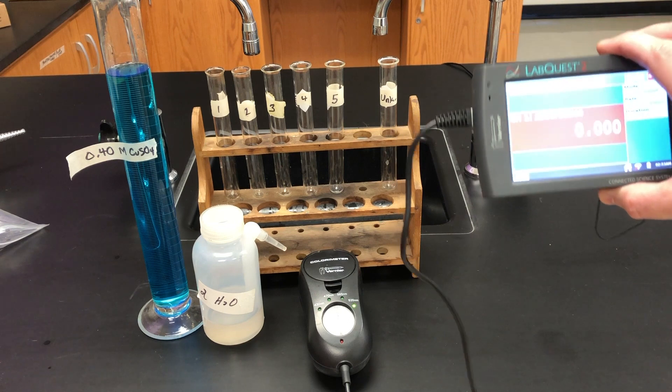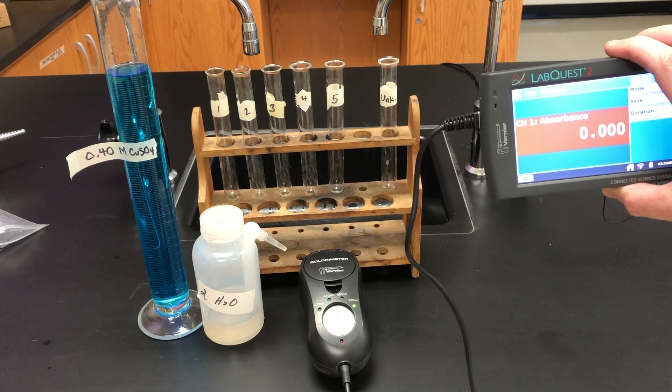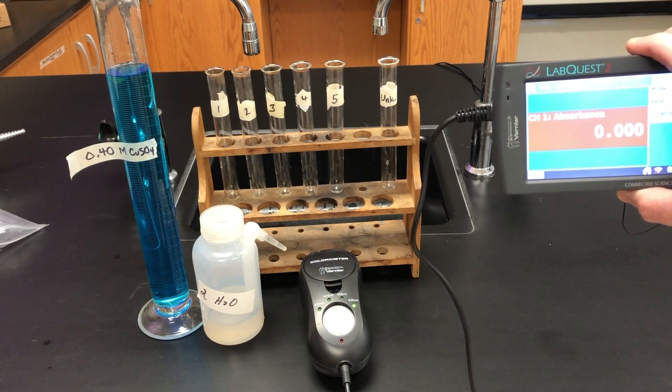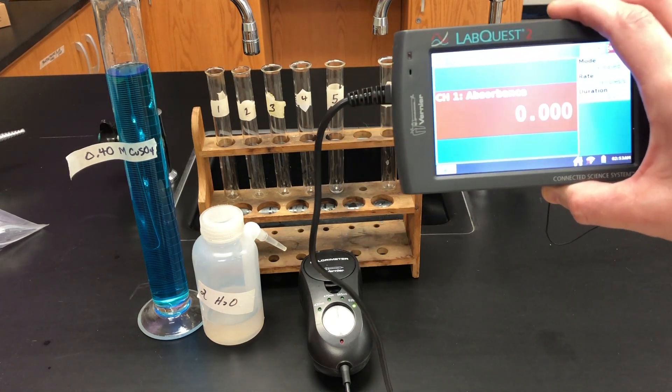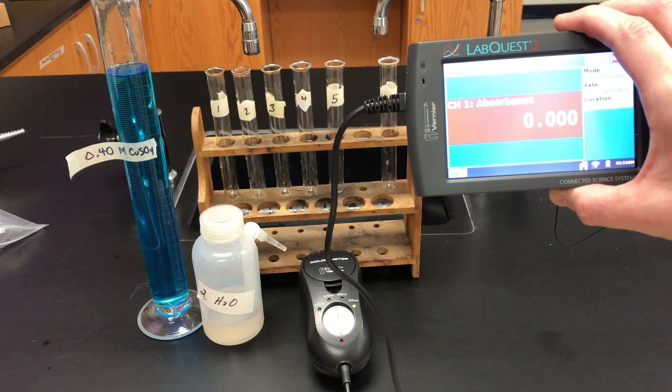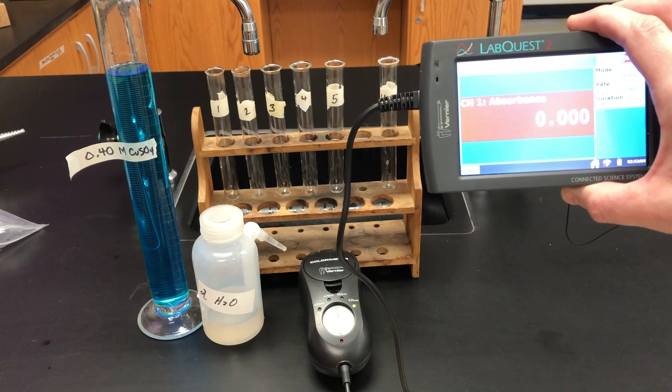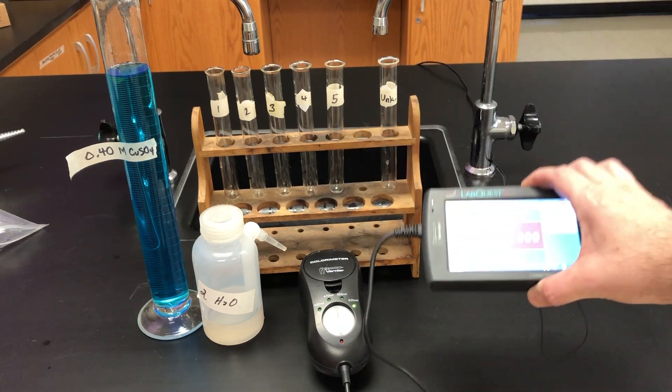The lab quest right now is reading zero, because right now all we have in it is water. You want to set it up that way so there's a baseline. Water is colorless, so it's not reading any absorbance whatsoever. All the light is passing through it, as you can see there. That's how we'll be looking at the display once we do subsequent measurements.